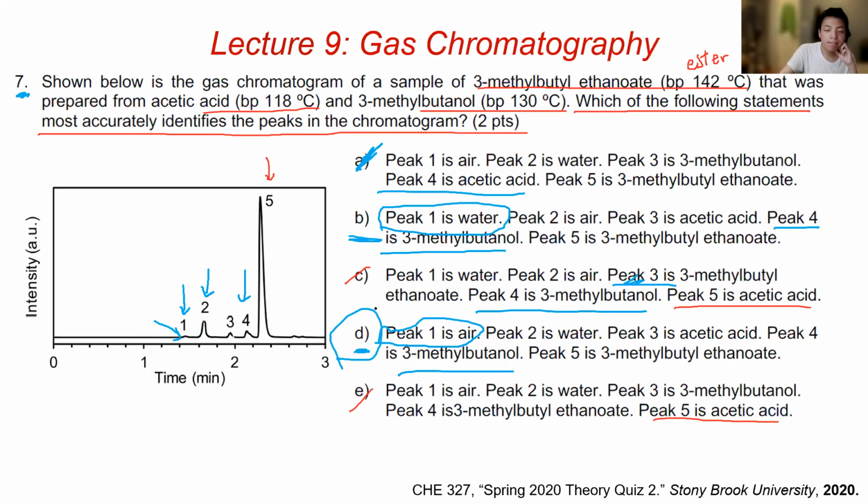Any questions? If they didn't have alcohol as the impurity, could you assume that it would be the acetic acid, because in the synthesis acetic acid is going to be in excess? In the synthesis, yes. And according to Dr. Hossein, by the moment you finish extraction, all of the acid should be out. But if it happens that it goes through, it will appear on the peak. But say that it was given that the alcohol will be here.